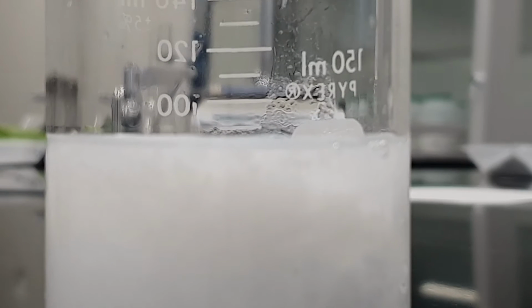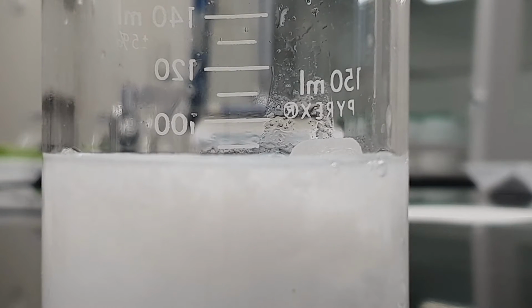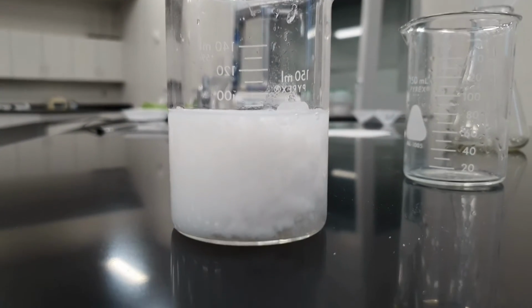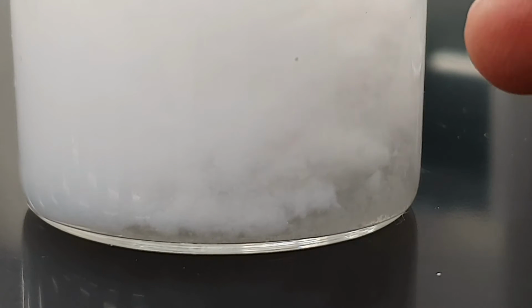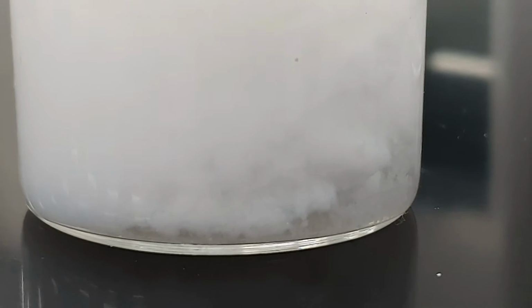As you're looking at that, that went from a clear substance to looks rather cloudy now. Okay, maybe I can show you down here at the bottom. We just kind of see some of it. If I get that to focus there. So we see some of the particles over here on this side kind of starting to keep moving and dissolving, or not dissolving, but mixing.